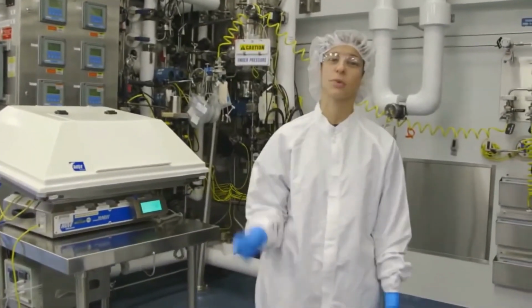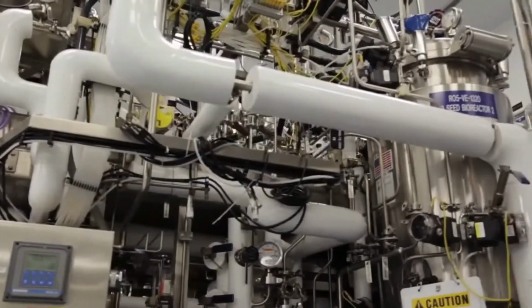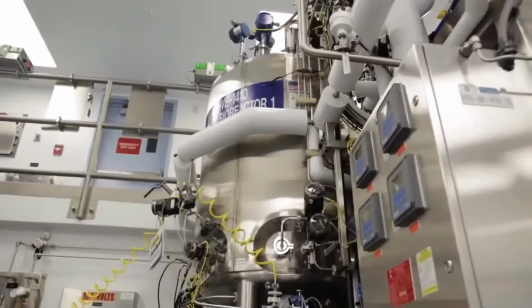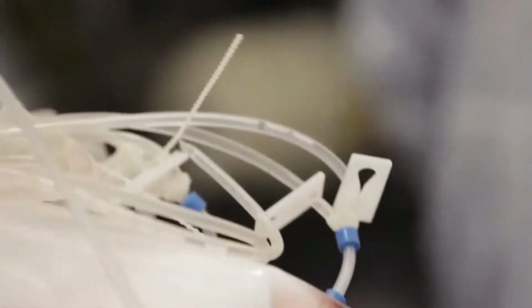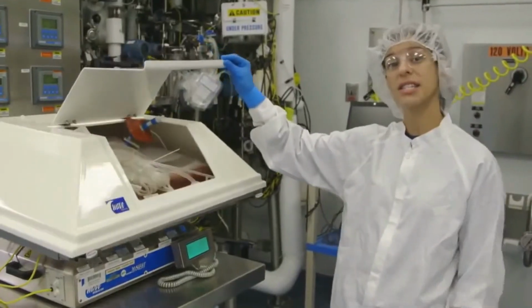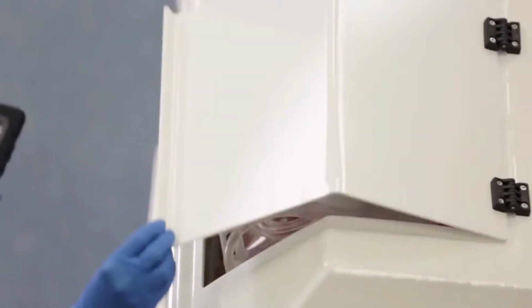We start our process with just a 2 ml vial of cells, and we continue to scale up to bigger and bigger volumes. This is a 50-liter cell bag bioreactor. It's one-time use only. We run this process for 3 days, and we continue to scale up.